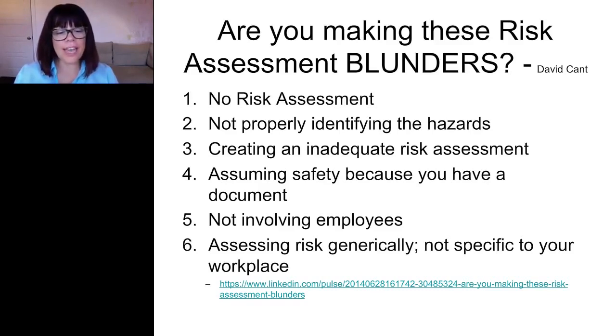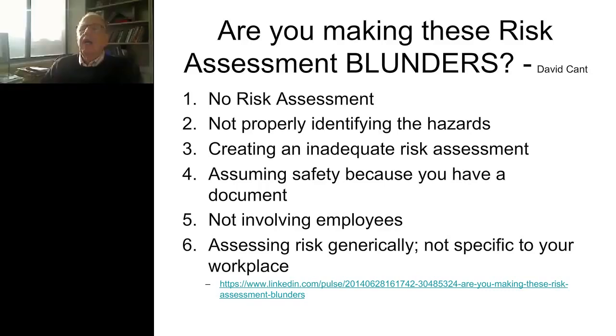Our next question of the day asks, our lab is getting a MALDI-TOF. Are there biosafety risks that we should consider? It's becoming much more common in laboratories today. It's a great instrument, and I think it's excellent.